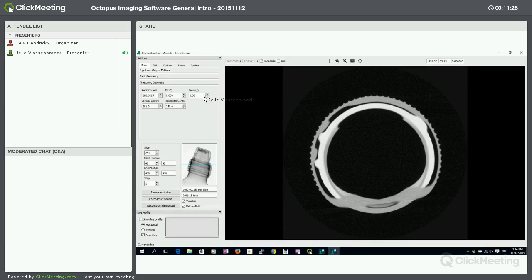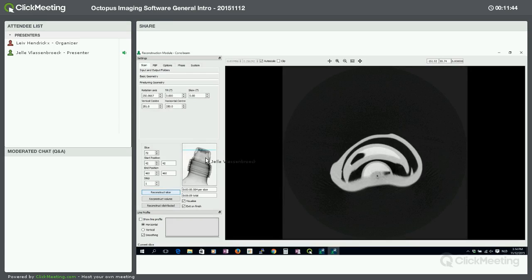There are some other misalignment parameters like tilt and skew. Sometimes you can also right-click and optimize them, and sometimes you can already have an effect on the central slice. If not, you can select a slice which is, for example, completely at the top. First look at one slice, see if it's okay, and if you're not really happy with it, you can optimize tilt and skew.